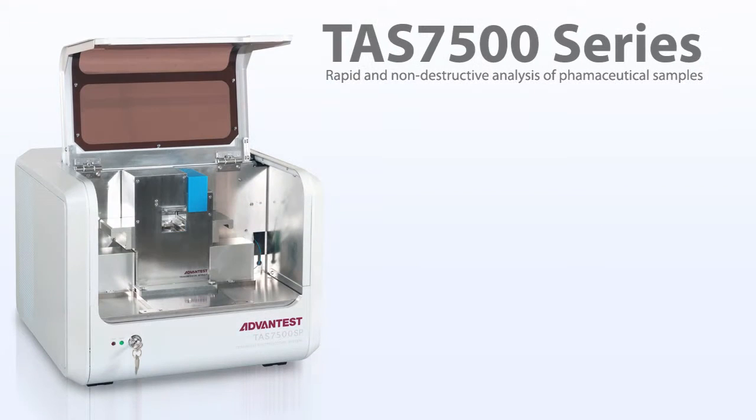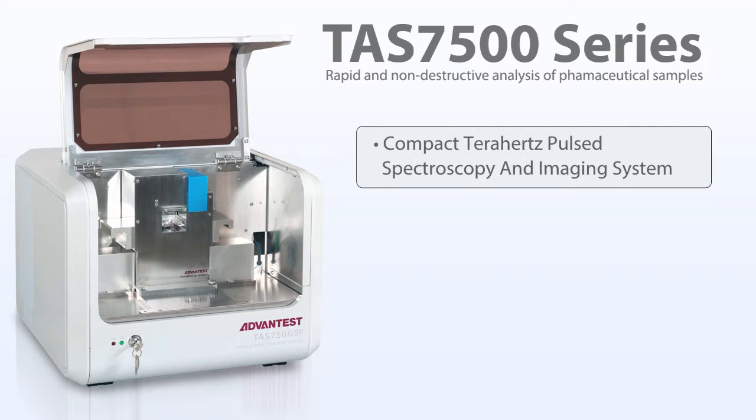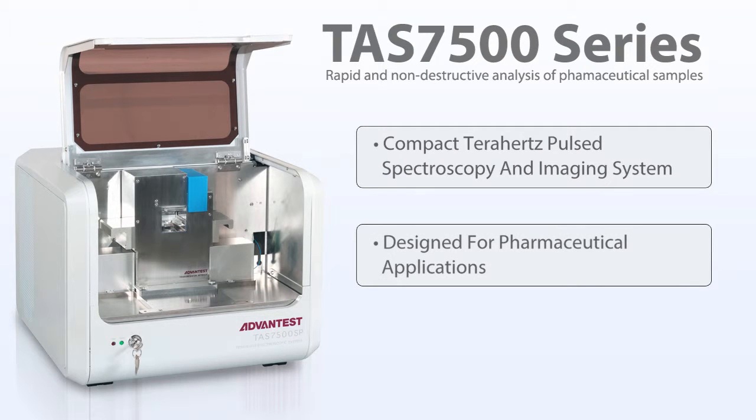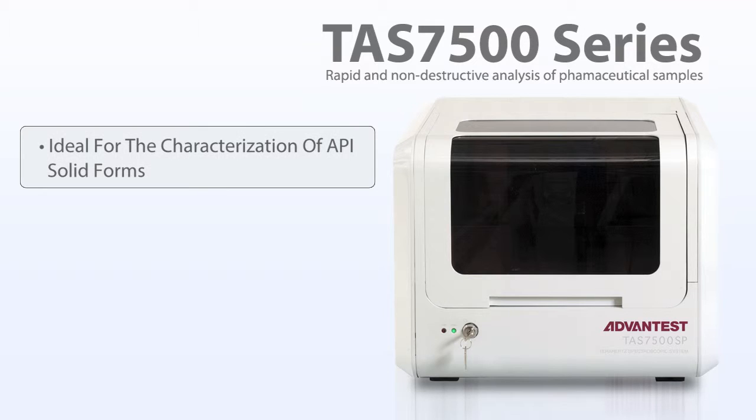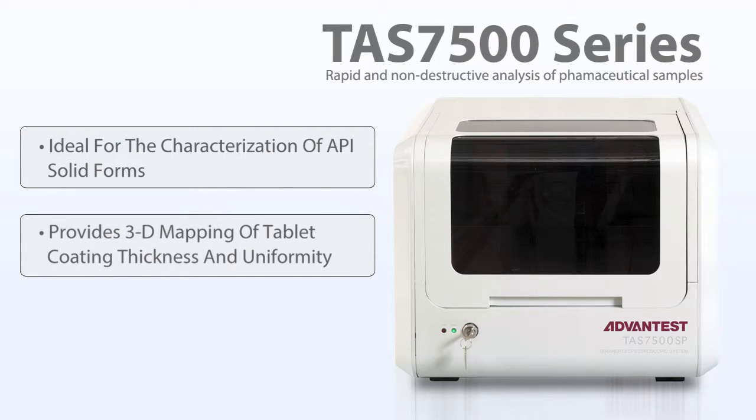The Advantest TAS7500 is a compact terahertz pulsed spectroscopy and imaging system designed for pharmaceutical applications. The spectroscopy unit is ideal for the characterization of API solid forms, while the imaging unit provides 3D mapping of tablet coating thickness and uniformity.